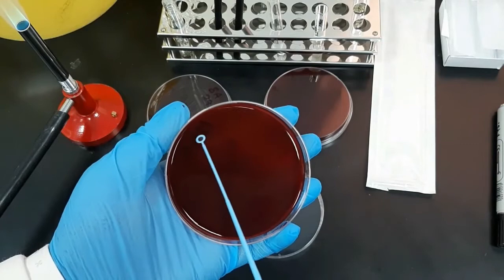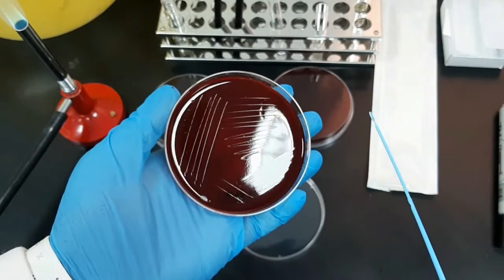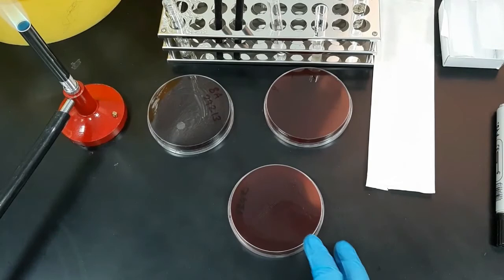Then turn the plate at 90 degrees and streak only one or two times into the next quadrant without overlapping the previous streaks. Again turn the plate 90 degrees and make more streaks by pulling out from quadrant two, and repeat the streaking procedure in quadrant four or in the remaining part of the plate.